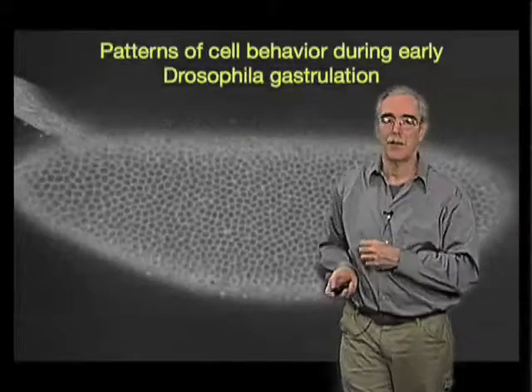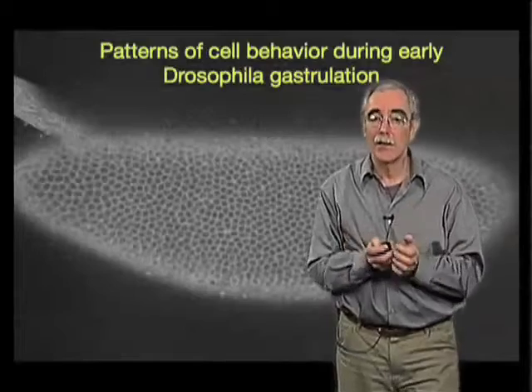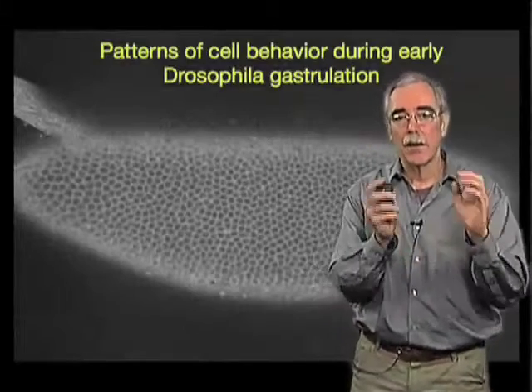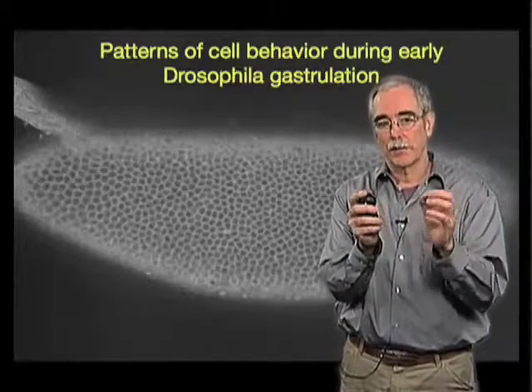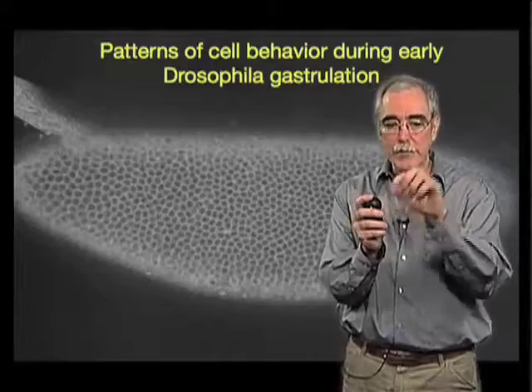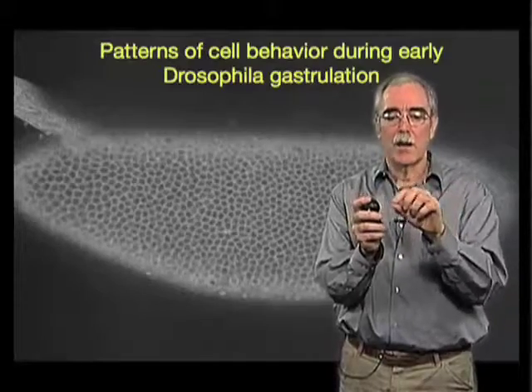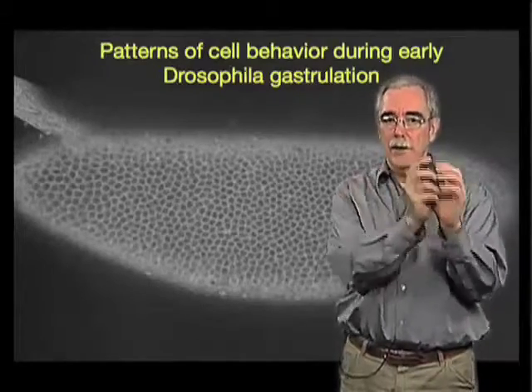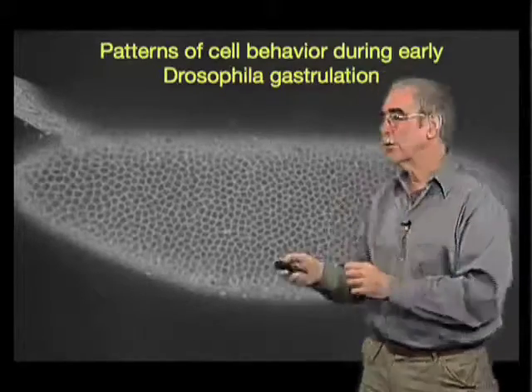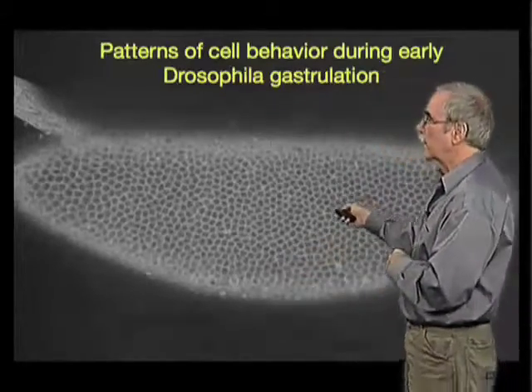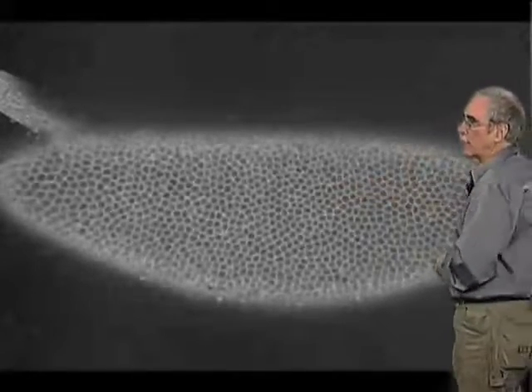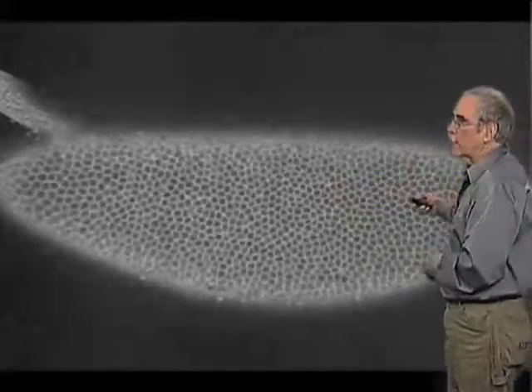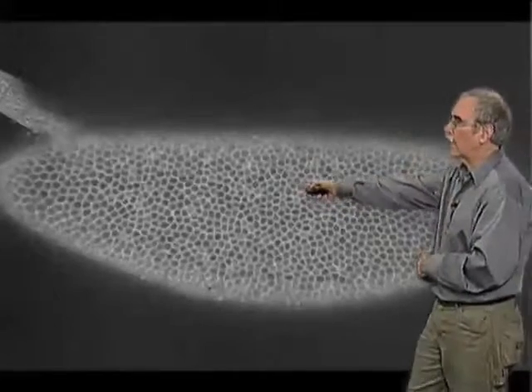We can actually watch these behaviors in living embryos by tagging the surfaces of cells with fusion proteins between GFP and various membrane proteins, so we can follow individual cell shapes. And watching this movie again, this is the blastoderm stage that we talked about.